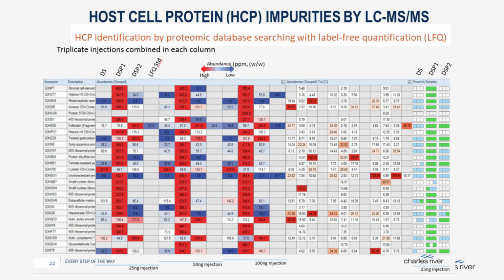these proteins are. And then you can also get some relative abundance information for all of those proteins to compare them amongst the samples. And so of course, the abundances that are high are in red, and that's going to be earlier in the DSP, in the downstream process, so DSP1. In order to obtain this quantitative information, there are several ways of approaching it. One is using an LFQ or label-free quantification standard, different proteins that are just spiked directly into the samples.